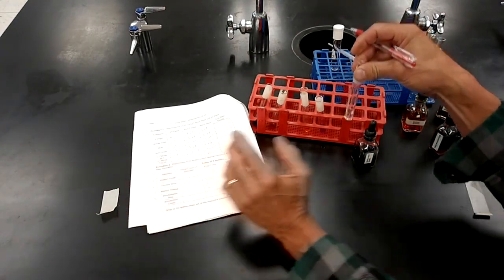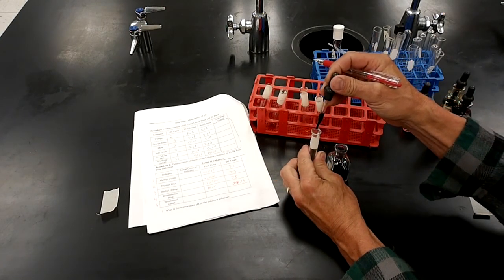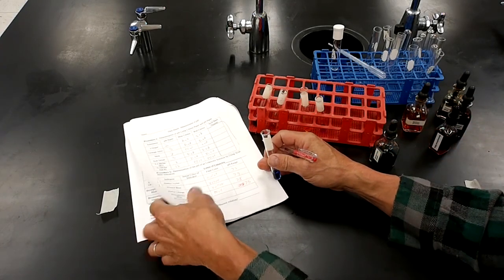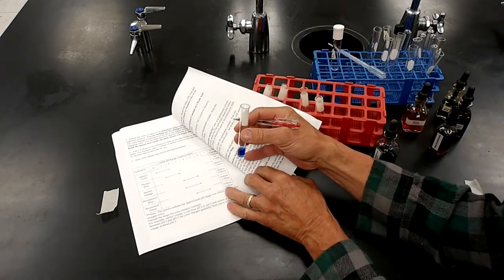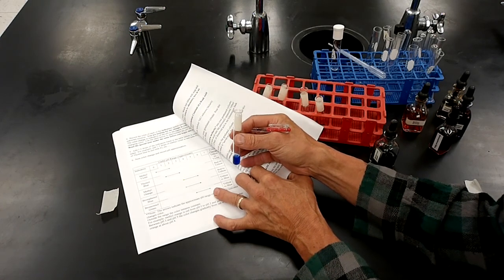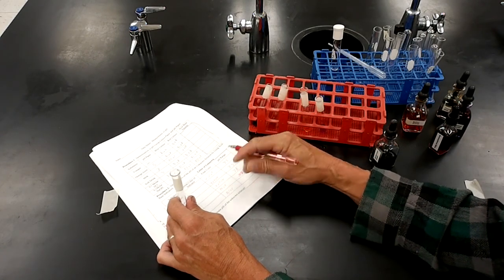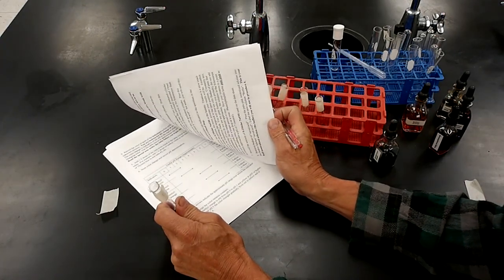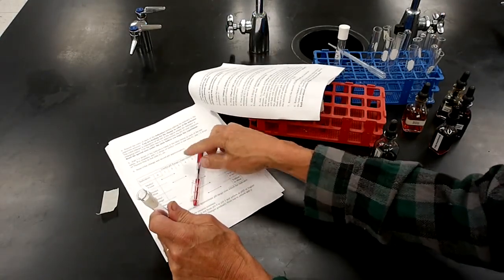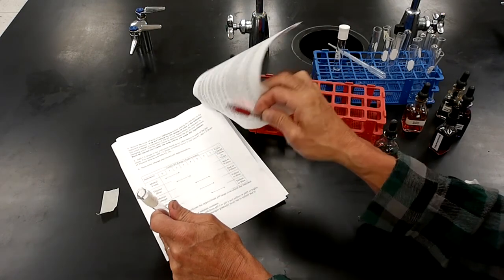Then we'll try the last one, tube number 5. Bromcresol green. Yellow to blue, that's definitely not yellow, it's blue. And that puts it about 6 or 7.